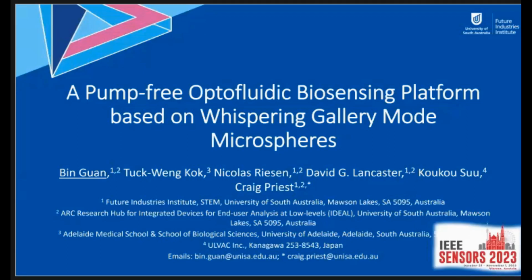Virus detection purpose. So the motivation behind developing this platform technology for sensing is mainly we want to have a versatile platform for making lab-on-chip sensing devices, so they can be used in all sorts of point of care or healthcare related applications. So as you can see from my title, the approach that we're taking is optofluidic methods.